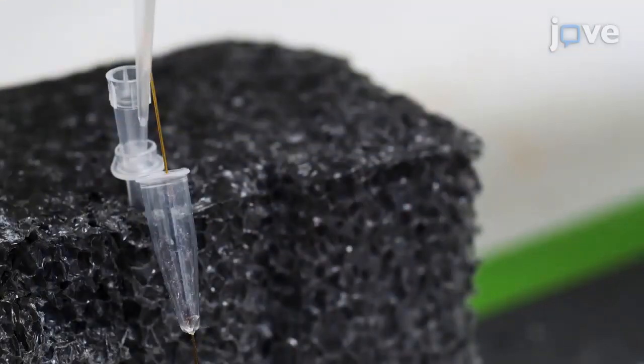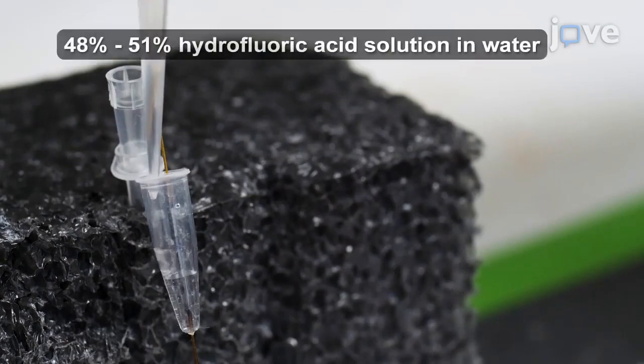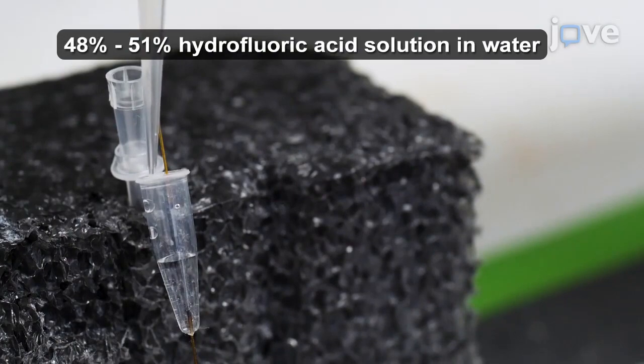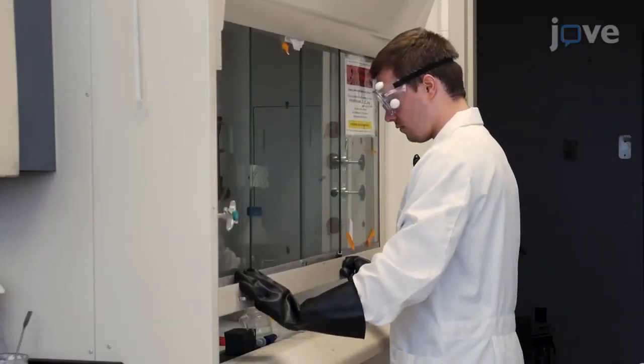Then add approximately 150 microliters of HF to the 200 microliter tube so that the HF solution is about halfway up the burnt portion on the capillary. Incubate the capillary in the HF solution at room temperature for 90 to 100 minutes.